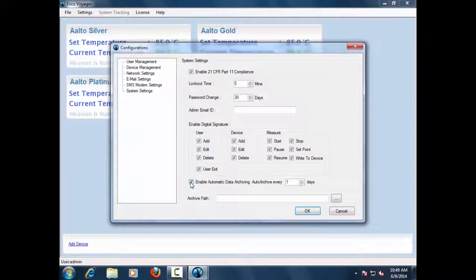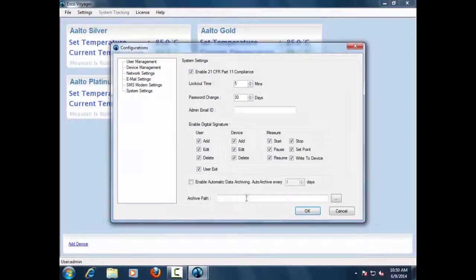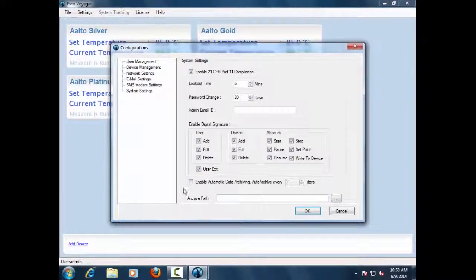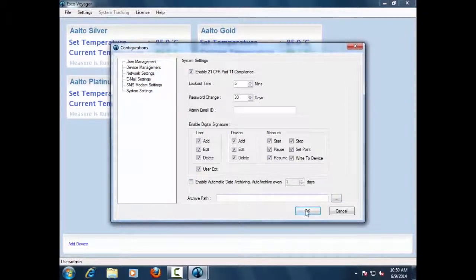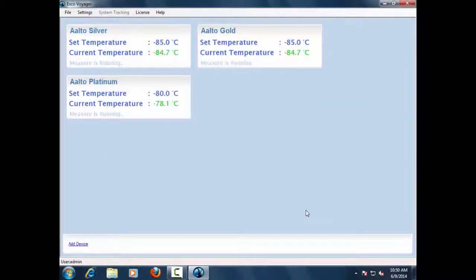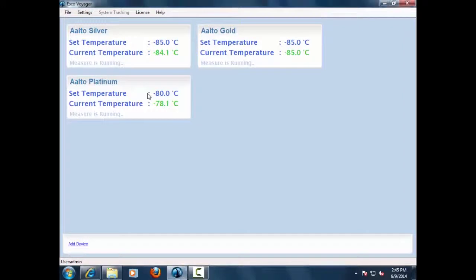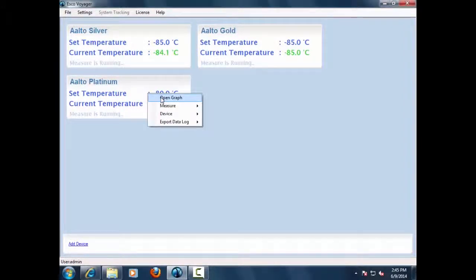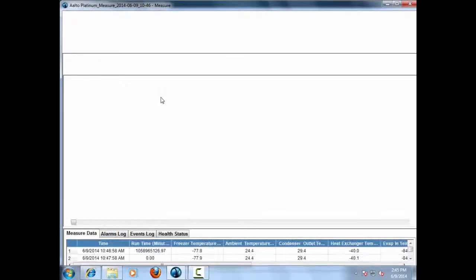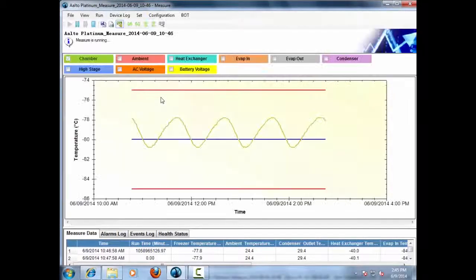Each device configured in Voyager is represented by a device block which is displayed in the main window. The user can access all functionalities related to the device using this device block. The user can view measurement windows of the individual devices connected in the Voyager software system.